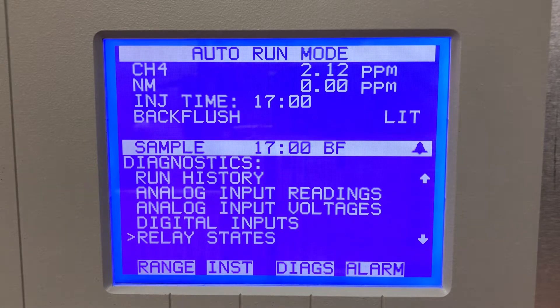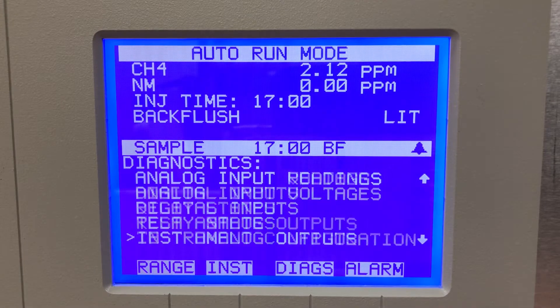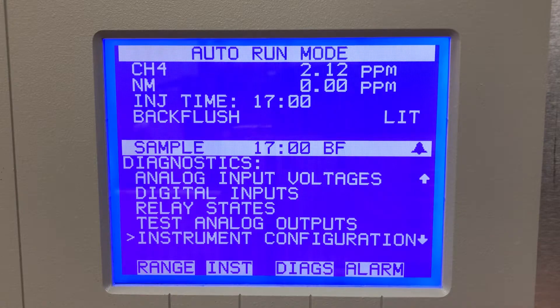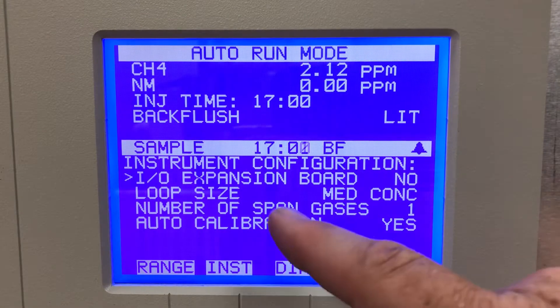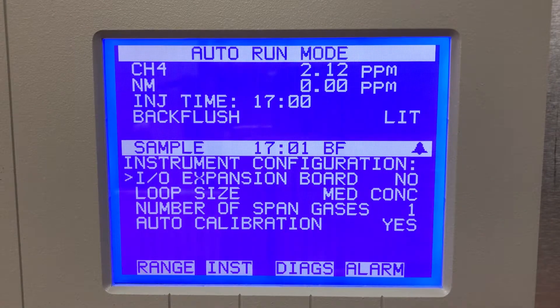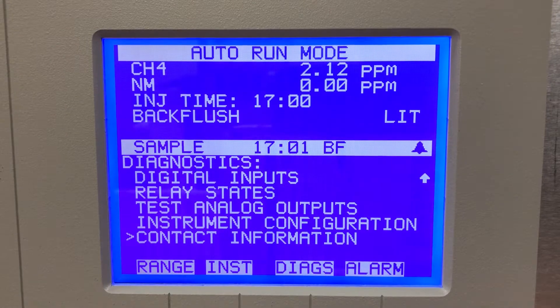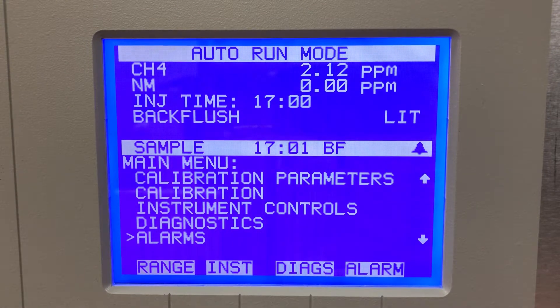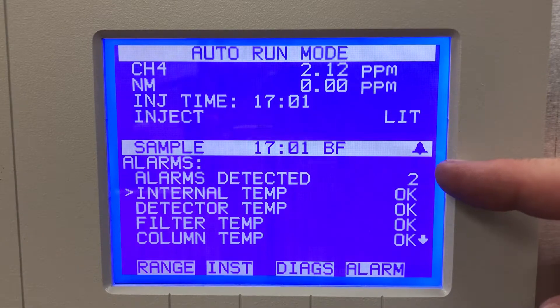Analog input readings, input voltages, digital inputs for control, remote control, relay states for alarm status — you can test your analog outputs. Instrument config tells me what size of sample loop I have in this unit — loop size is medium for that range of 20, 200, 2000. And contact information.